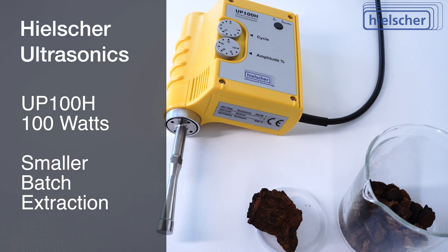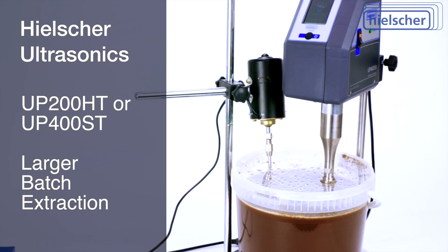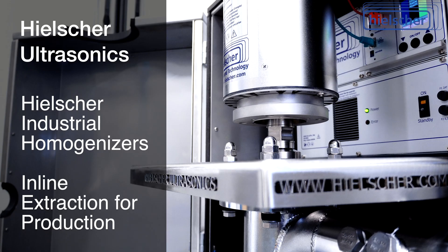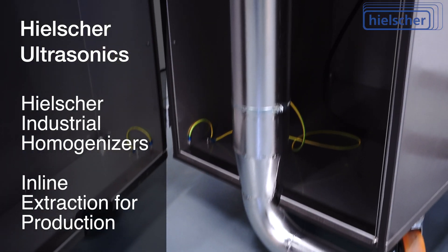This UP100H is one of the smallest units. For larger batches, consider the Hielscher UP200HT or UP400ST. For the inline extraction of larger quantities, Hielscher makes industrial ultrasonic homogenizers and flow cell reactors.